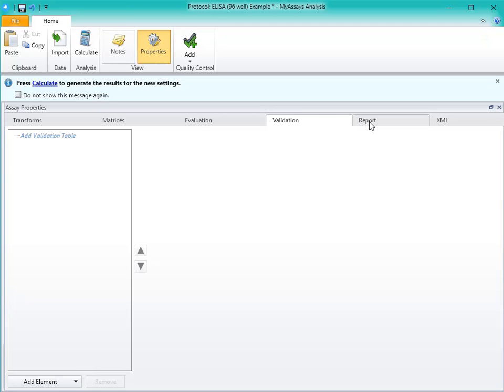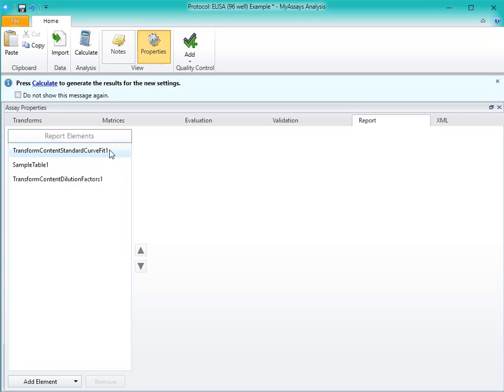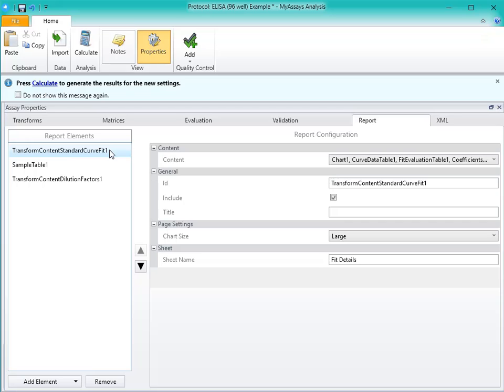Using the Report tab, you'll see your report elements listed in the pane on the left-hand side of the page in the order they will appear on your report. By clicking on a report element, you can specify associated settings and reorder the elements by using these arrows.